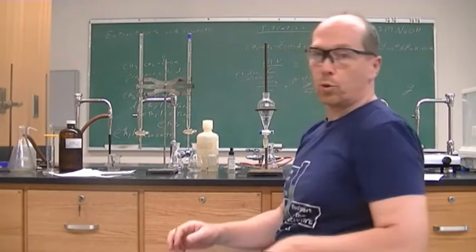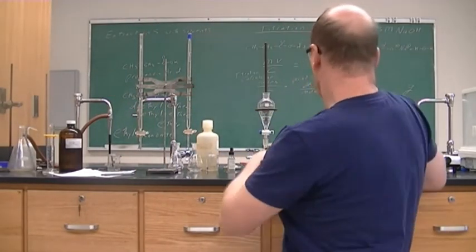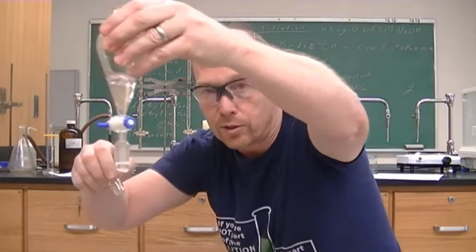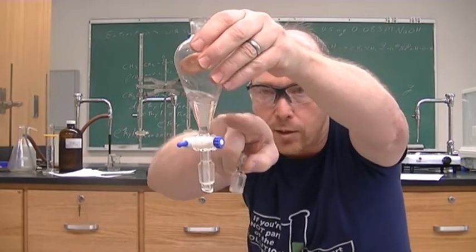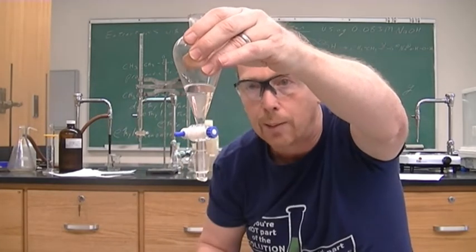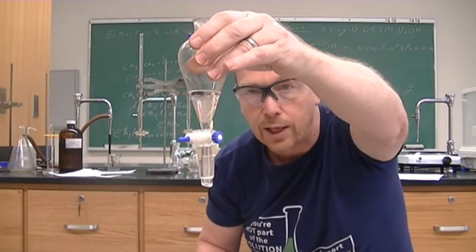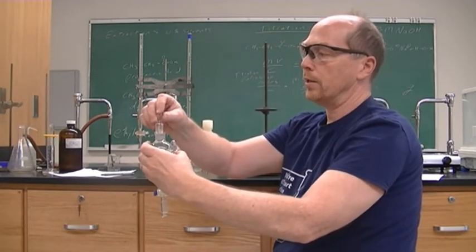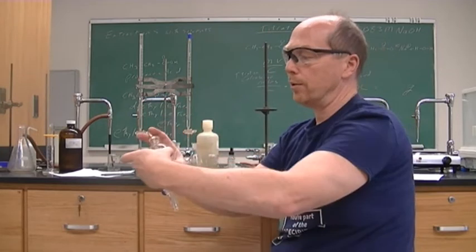And so the same rules that we had last time. So we have our 2 layers. Now this time the 2 layers are up higher because we only have 5 mils of ether, so there's only 5 mils on top instead of 15 last time. But you have your same 2 layers. Again, the first time you have to be very careful.